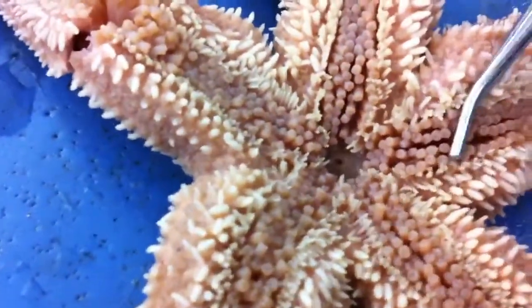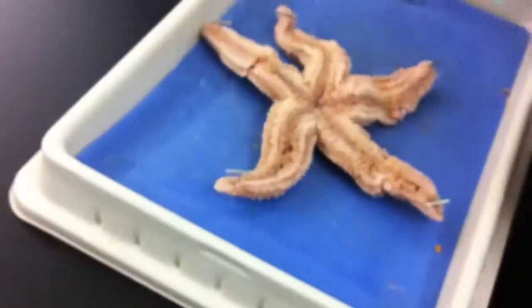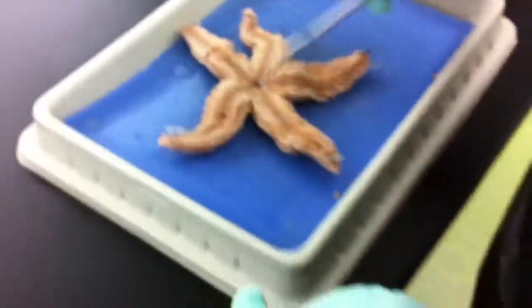Is that the mouth? That's the mouth, right? No dude, starfish don't have mouths. They just take their stomachs out and eat with it. This is where the stomach comes out of.